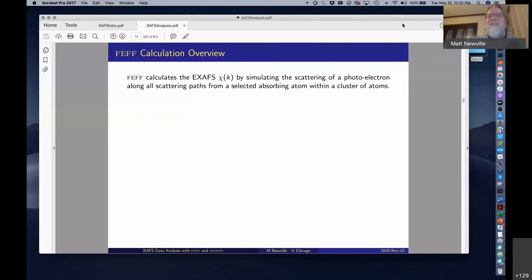And if they're not consistent, you're at the noise level where it's going to be difficult to say which of those two models is better. Honestly, you want to pick one, but if the two models are equally good, it's hard to tell the difference. That's true.